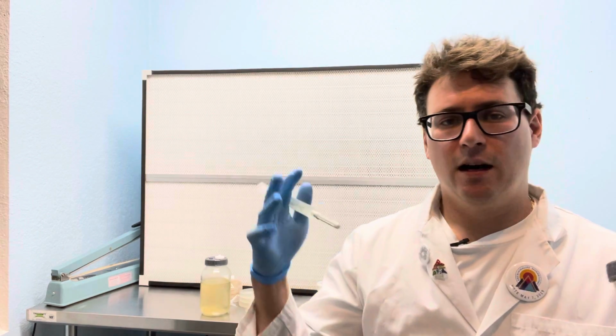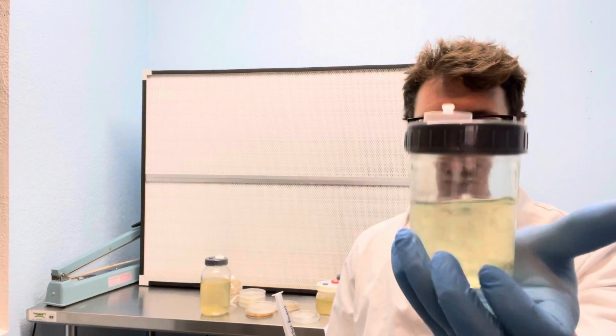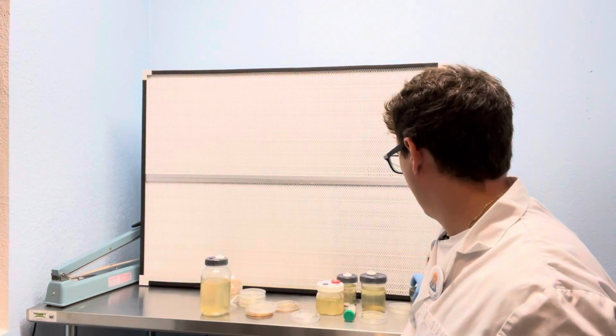If you see any blotchiness, like sliminess, that typically is indicative of bacteria. There are other confirmatory tests you can do to identify it. This is just a very broad screen of what is in this solution. So it's really important to do your quality control before moving on.